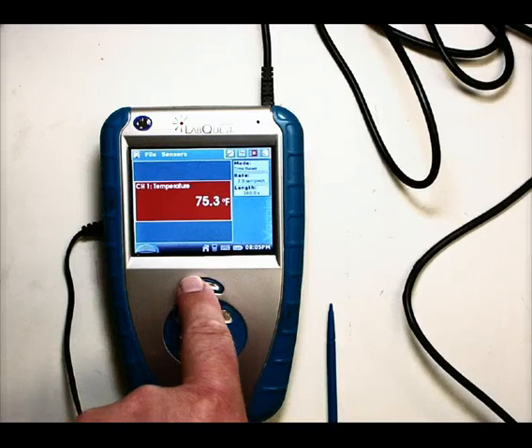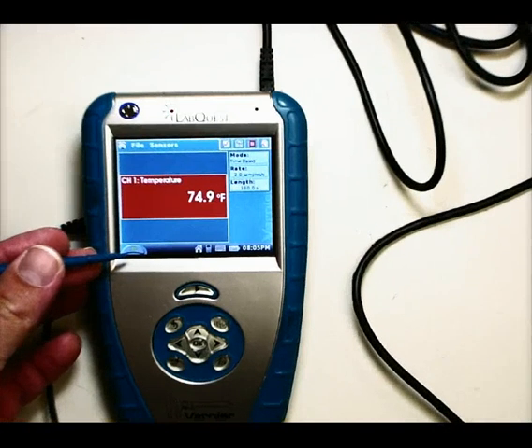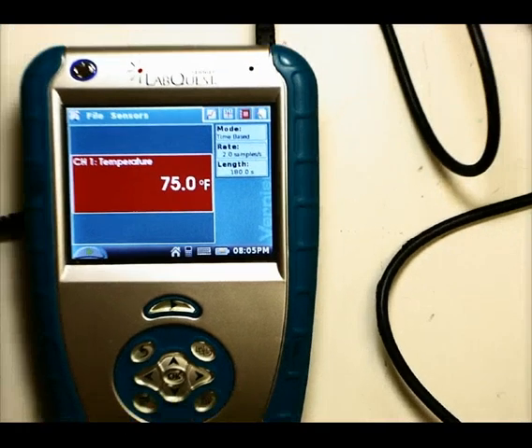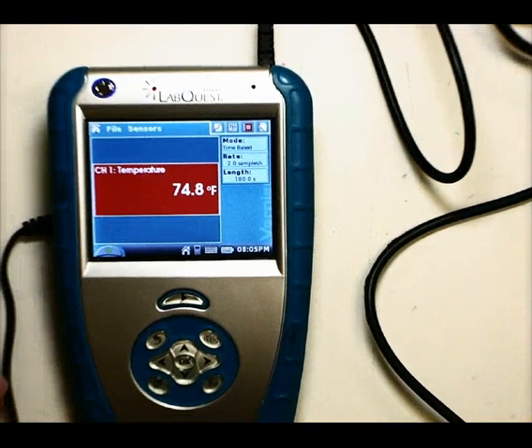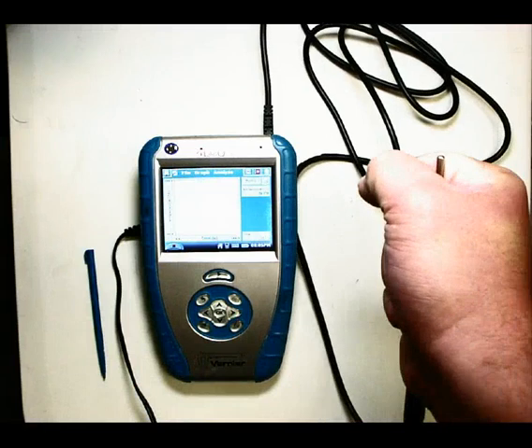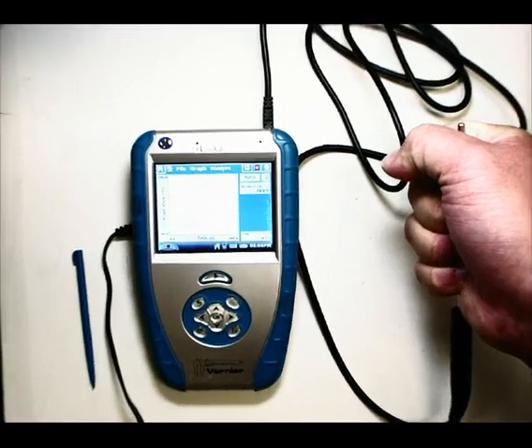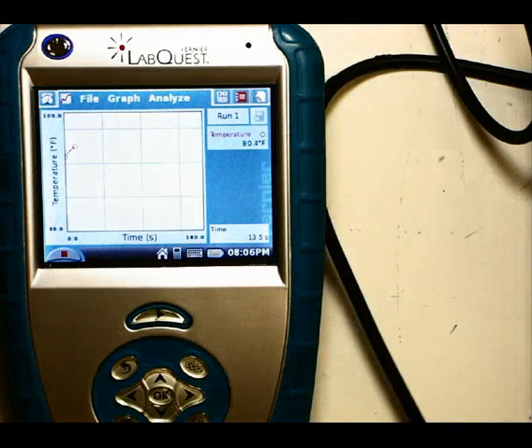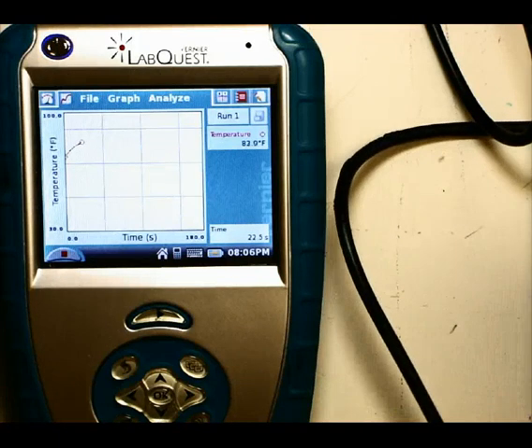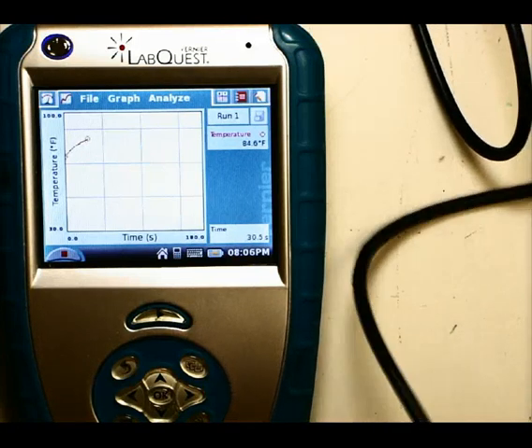To start, hit the play button — it's a physical button on the LabQuest that you push. Alternatively, there's also a play button on the screen in the corner. Both buttons have the exact same effect, so you can choose whichever you'd like. I'm going to grab the thermometer in my hand and hit play. Now the LabQuest is collecting data, and what you'll see is that it's putting that data on a graph, showing how the temperature is changing over time. This is set to run for 180 seconds — however long you set it for, it will run and collect that data for you.